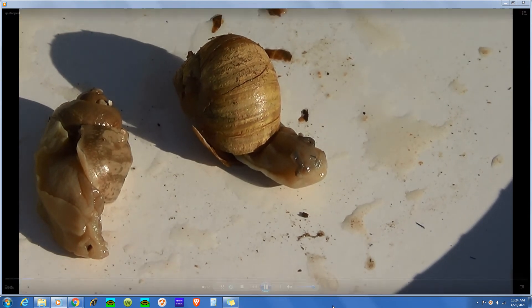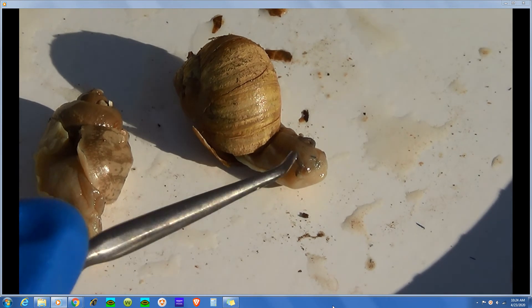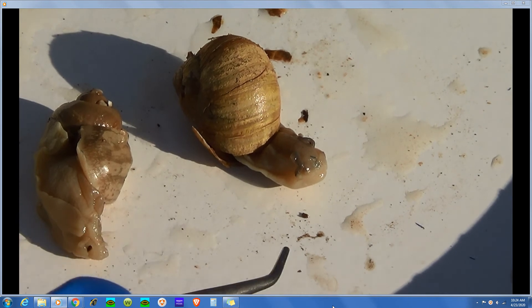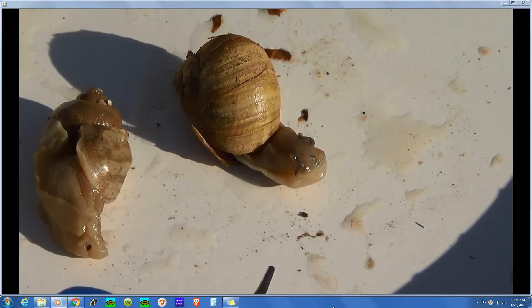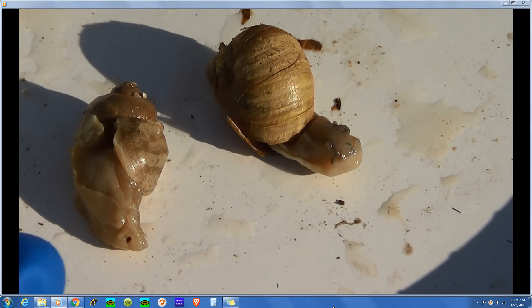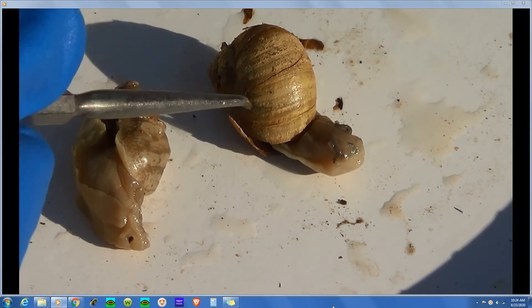The reason I say pulmonate is that pulmonary means lung, and they don't have lungs, but they do breathe air. They don't inhale and exhale. Instead of gills, which would dry out on land — these are terrestrial animals, terrestrial from terra meaning land — the gills are diminished, and the inside surface of the mantle is their respiratory surface. They use that for gas exchange, exchanging oxygen for carbon dioxide, the oxygen needed for cellular respiration.